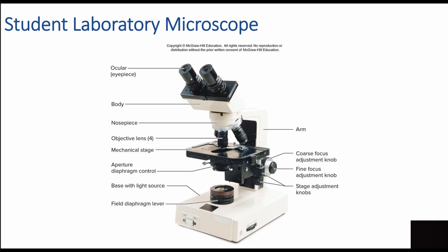These may have 15x for the oculars, perhaps. Ours are 10, but there are some that do others, and then the magnifications are different as a result with the objectives. So it's good to report the final magnification, and that way anyone that wants to reproduce your work will have what they need to achieve with their scope.